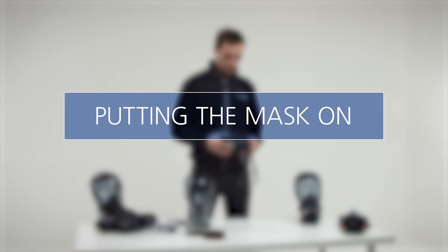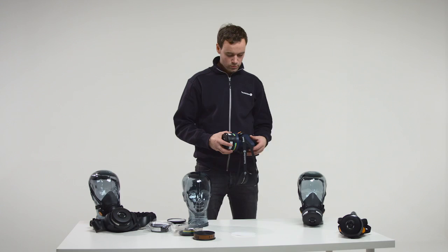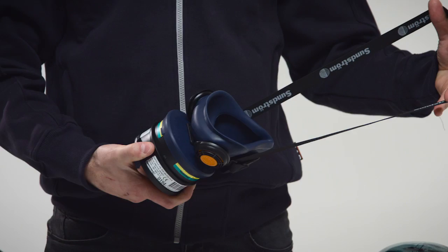Putting the mask on. Remove any hood, glasses or ear protection from your head. Holding the mask in one hand, grab the strap buckle and pull on the head strap until the pad is tight against the mask. Take out any twists or tangles.